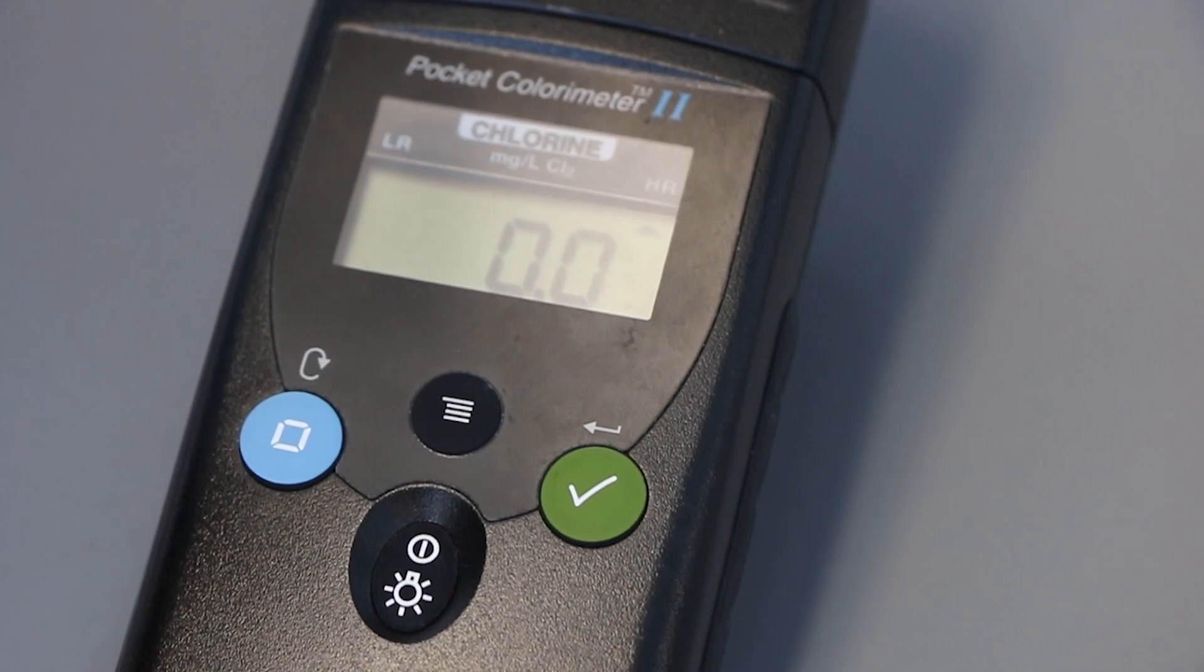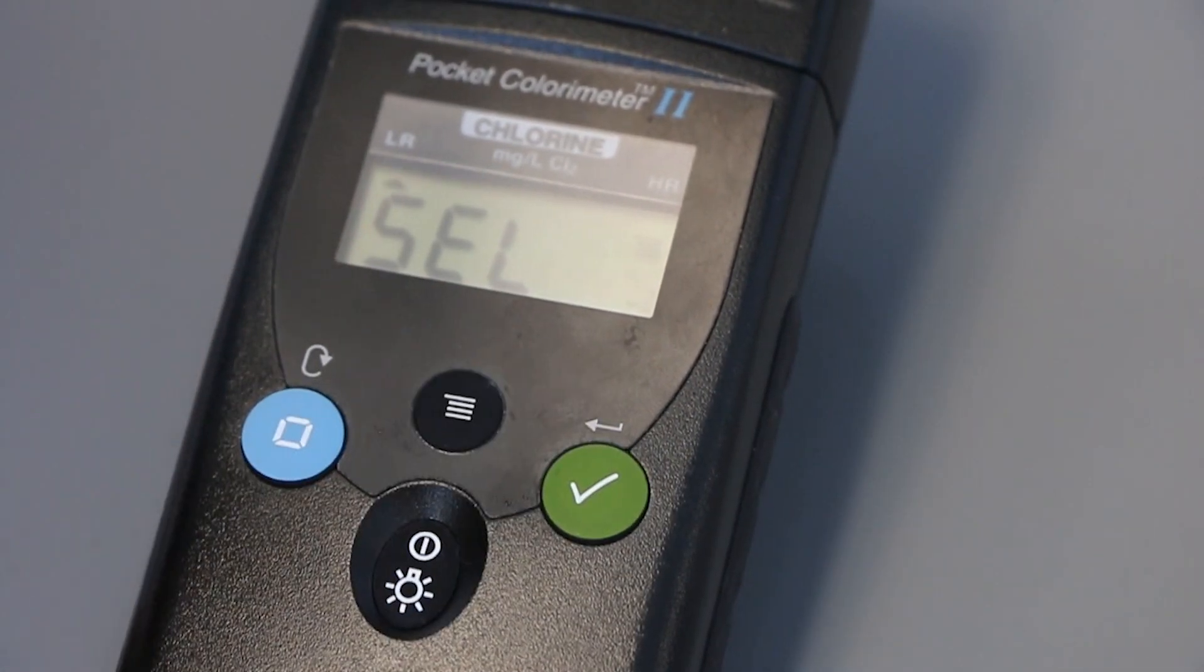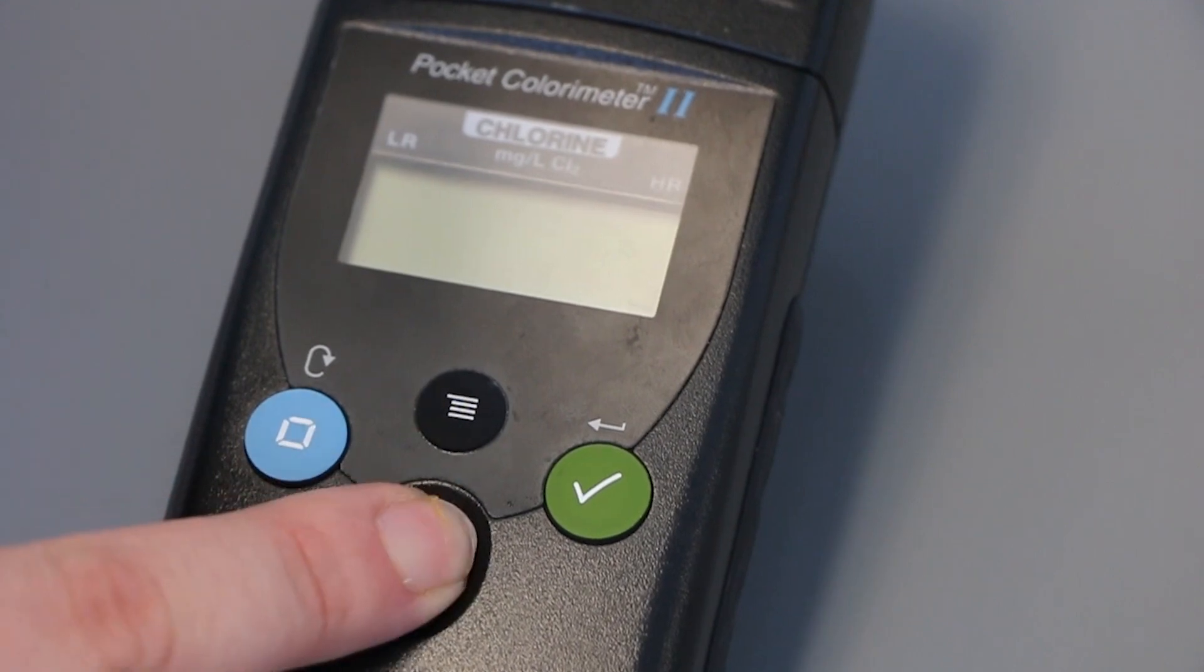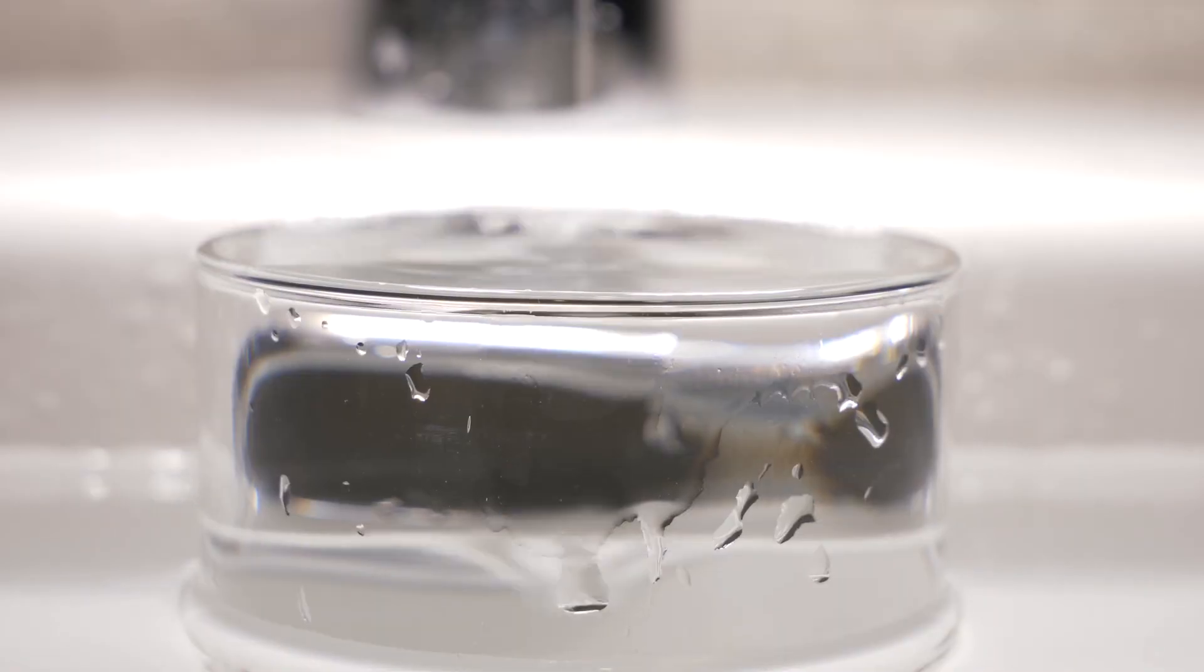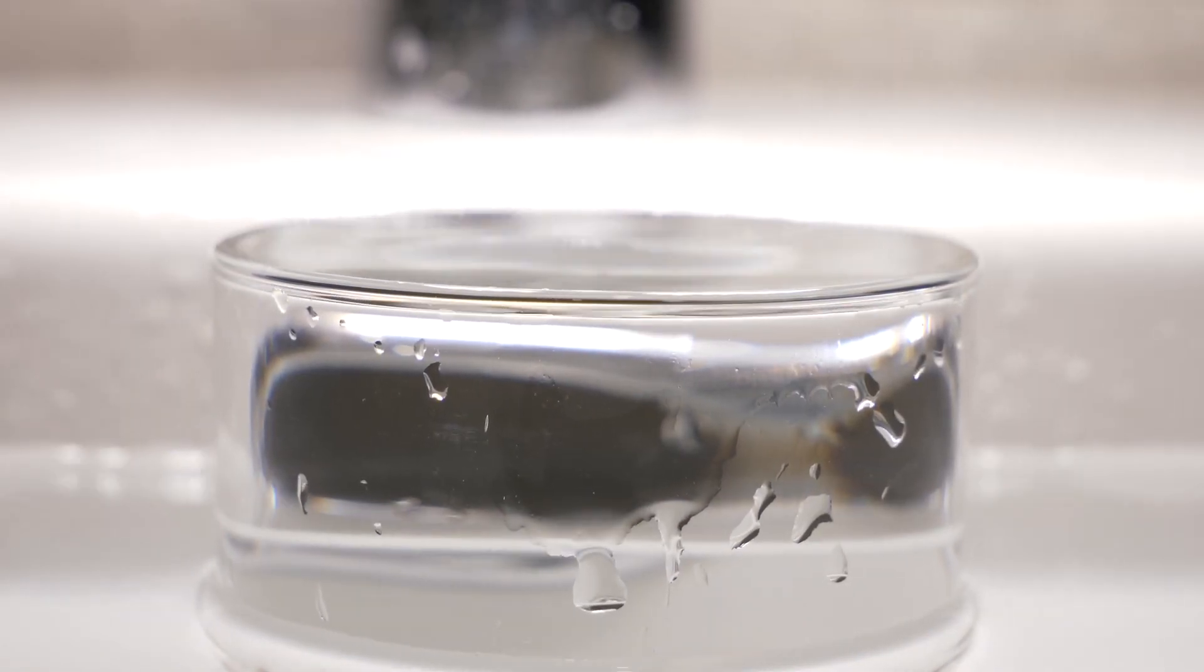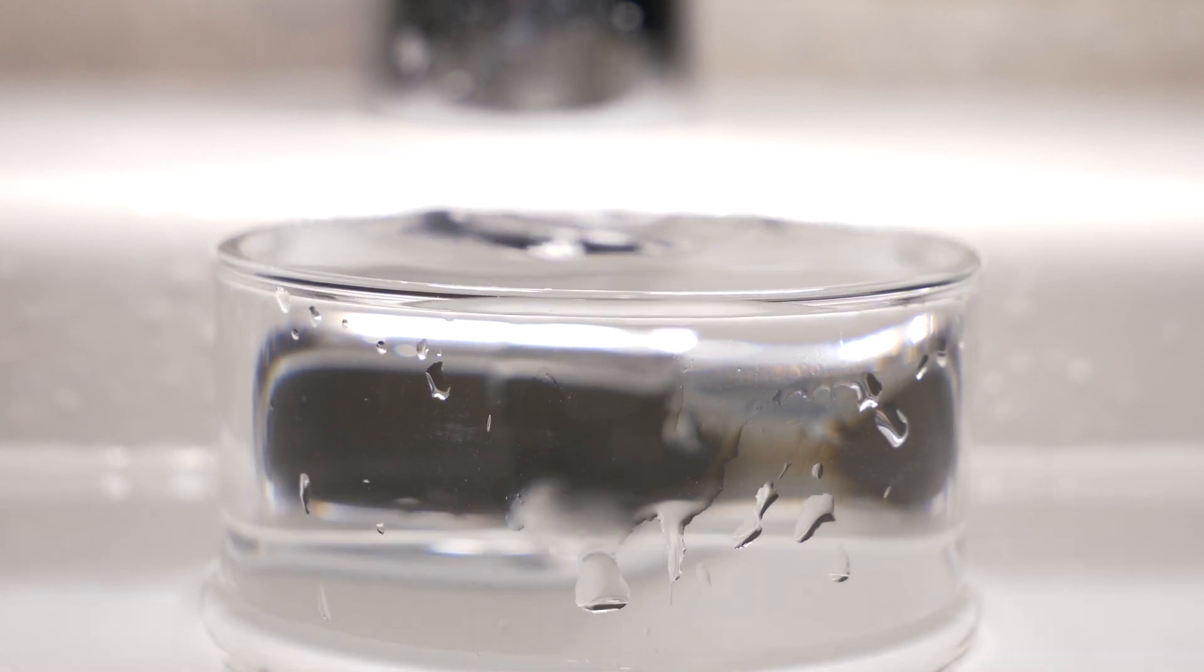To measure free chlorine residual, set your meter to the low range. High range usually doesn't capture the typical low chlorine residuals we see in community distribution systems, but may need to be used in the event that chlorine residuals are above 2.00 milligrams per liter.